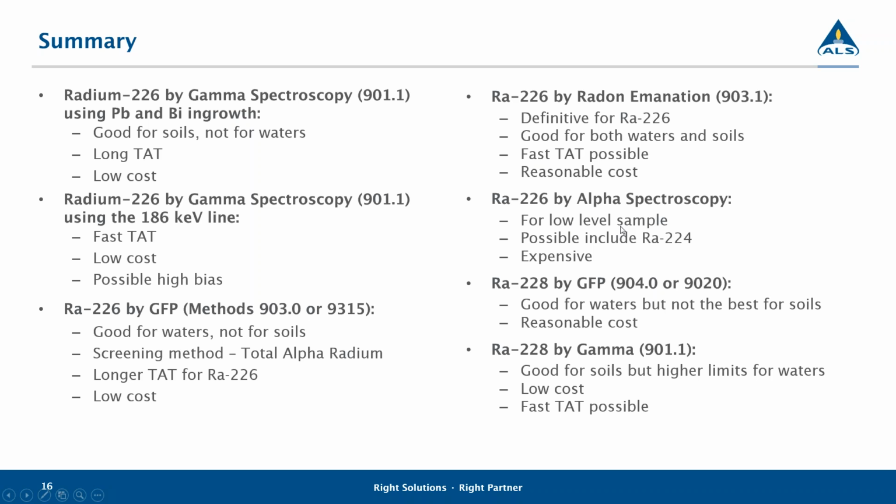Now, in some cases, other people have gone and you can get a radium-224 estimation by running it by gas flow, where you count the sample right away, let it sit for 14 days, recount it, and mathematically say, well, this is what my first count was, this is what my second count was, so second count is my 226 number, and the difference to get to the first count, that's what 224 contribution is. So it is an estimation of just making assumptions that you don't have any 223 in there.